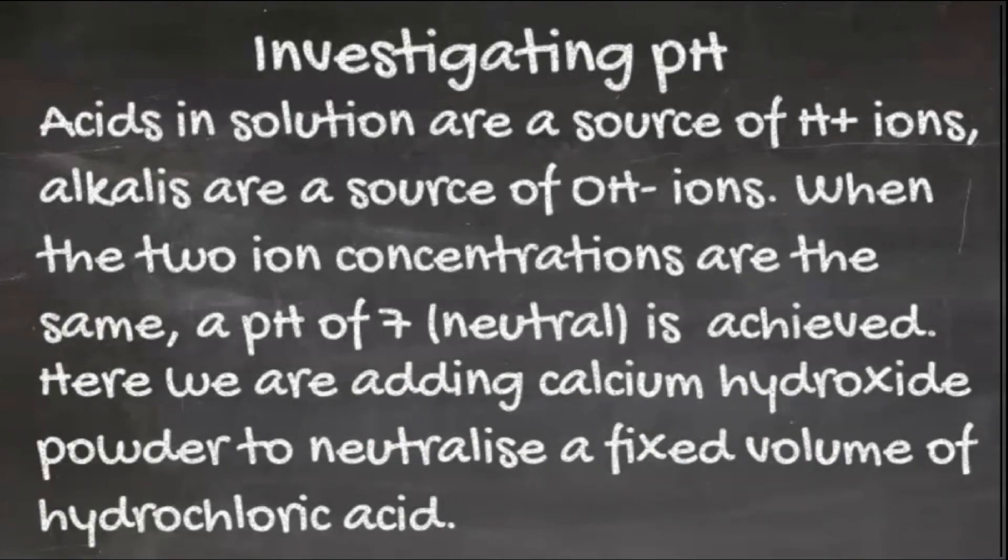Here we are using calcium hydroxide to neutralize a fixed volume of no-molarity HCl.